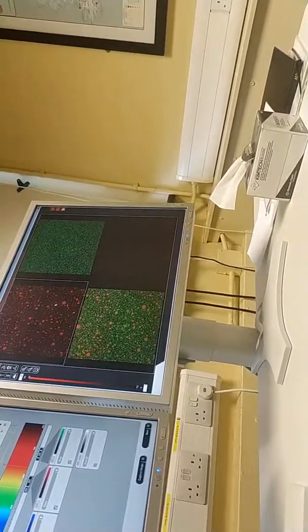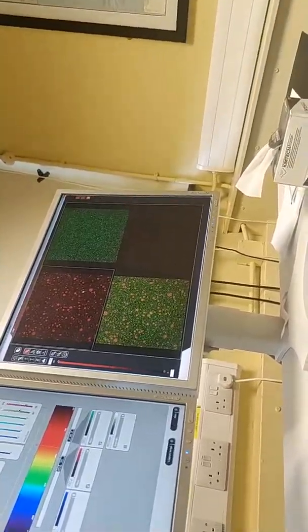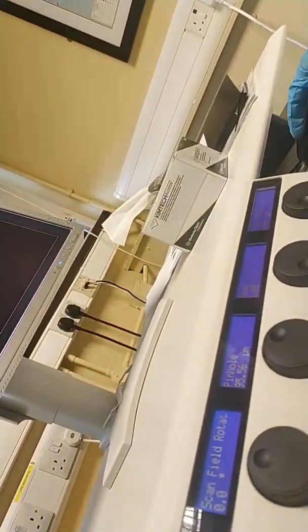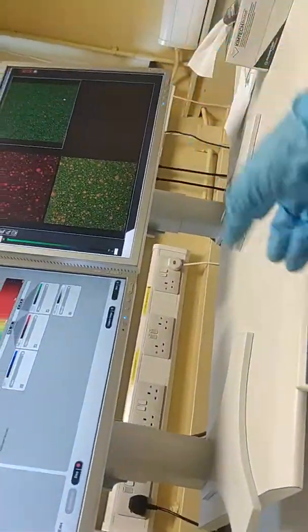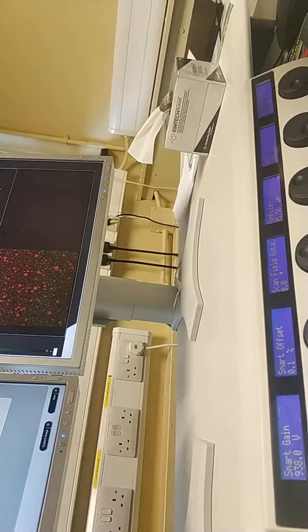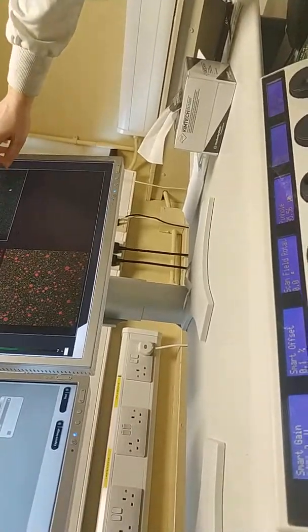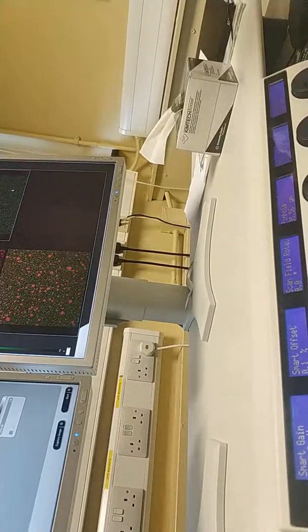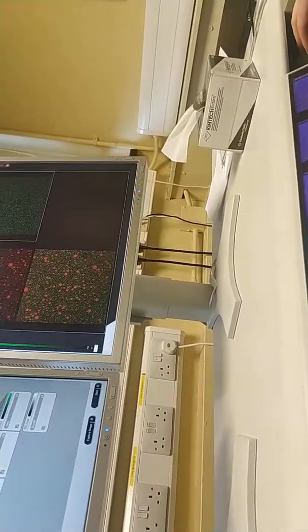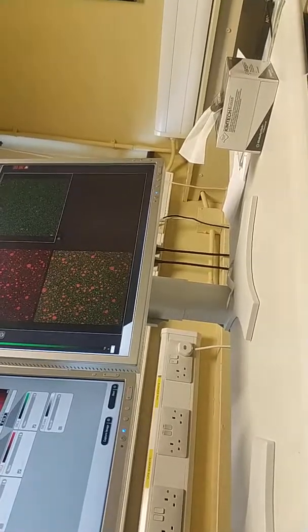So we will see, we can see the protein surround the fat droplets, right? I'm going to reduce the gain of the protein as well. You can decrease, but then you won't see anything really. If you leave it like this, you can see, for example, this looks like a small aggregate, but they are really small. That's why you can't see many. They are light, because it's the original sample. In your digested sample, you will see more aggregates.